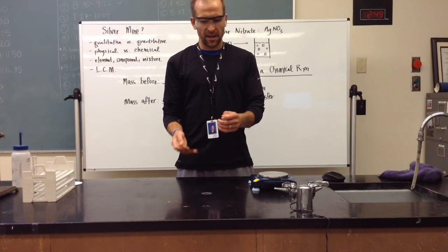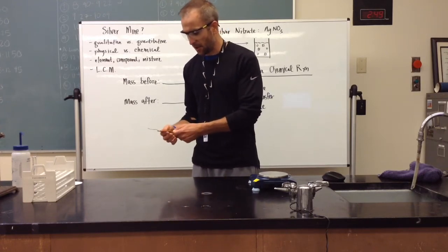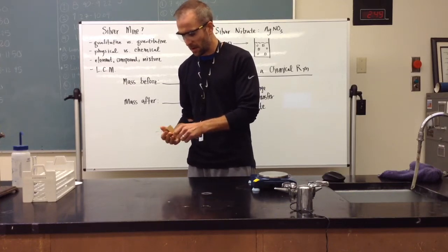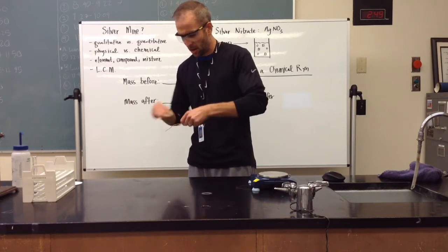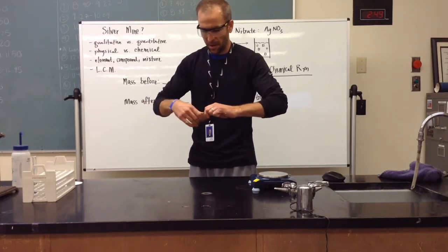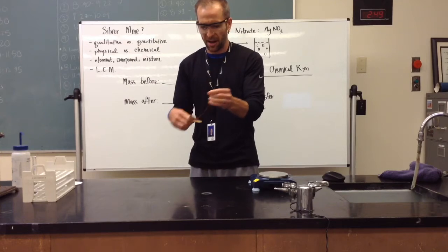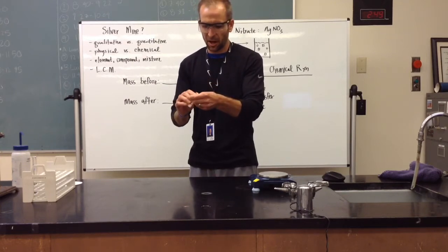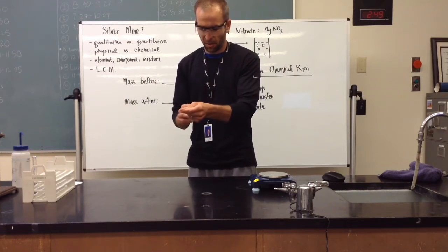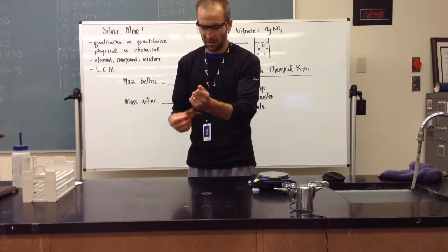First thing I'm going to do is sand down the wire really quickly to make sure that it's free of contaminants. Now, even though copper doesn't rust, we can still get some contamination on the wire, and it helps clean it off by using some sandpaper. As you'll notice, maybe it's tough to see, but it does get a little shinier after I have sanded it off. So I'm cleaning off some of that contamination. I'm going to make it that much better for our particular reaction. Okay? Finish wrestling this thing off here real quick.